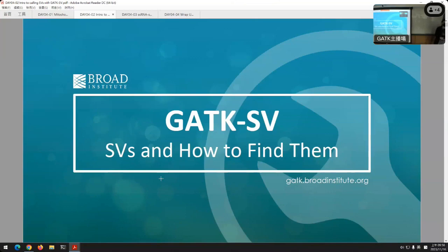All right, well, this is the moment that I've been waiting for because I work on structural variants, and now I get to talk about structural variants. So in this session, this is the very first time that we've presented this session, so that's exciting for me. And I will be talking about our pipeline for characterizing structural variants from short-read whole genome sequencing data. And that pipeline is called GATK-SV.